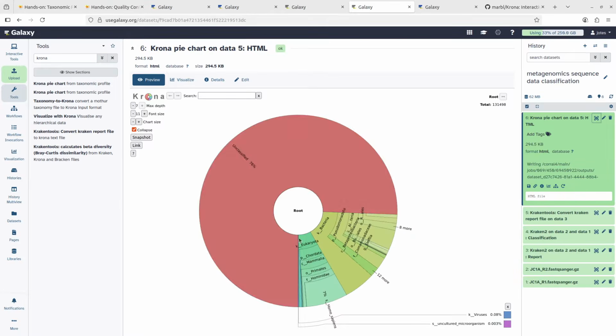This is information that has been observed from this input data, so that is what I am using to explain. So we have kingdom, and under bacteria, we also have phylum, class, etc. So it's in that hierarchical order. That lets you know the final details. If it's kingdom Bacteria, what groups or classes of bacteria are there? It can let you know, and sometimes it can also be specific. So you have to know how to discuss and interpret that.